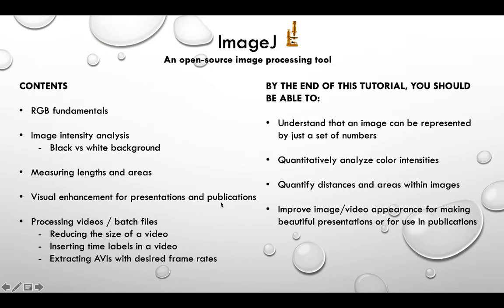Which brings us to visual enhancement for presentations and publications. So I will actually cover this topic as a part of processing videos and batch files. So what are batch files? We don't usually deal with batch files.